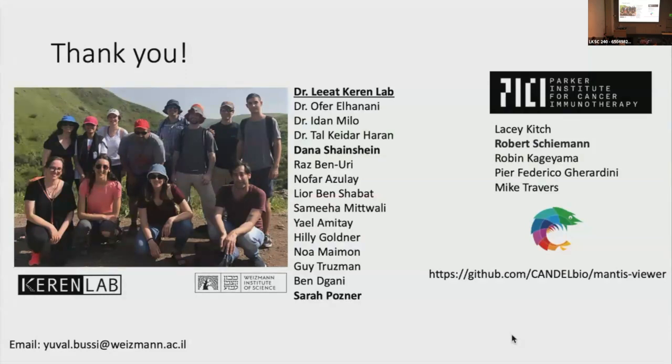One question, do you use the noised or raw images for labeling? So we've used the denoised images, and recently, I haven't prepared slides on it, but we've been testing what if we just put in the noisy images, and the results are not that much worse. But we're analyzing the effect of denoising for our upcoming preprint.